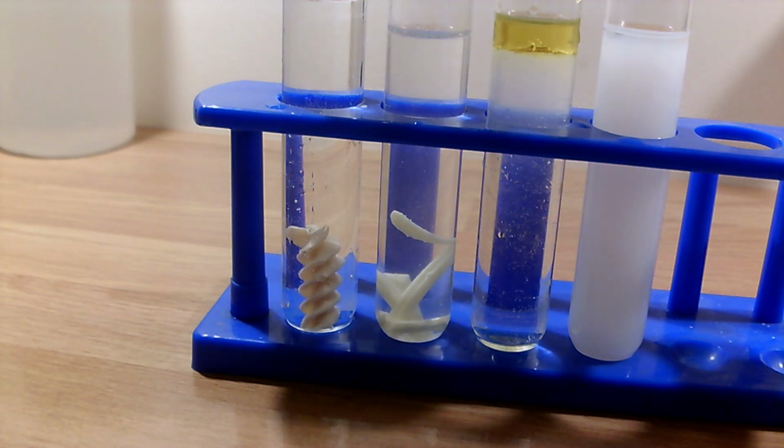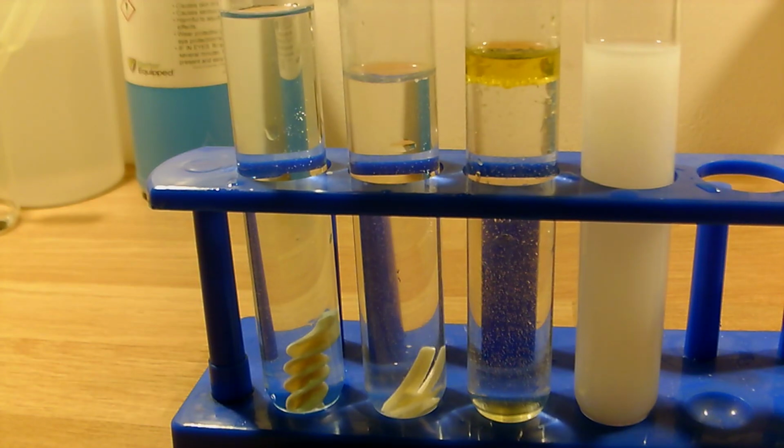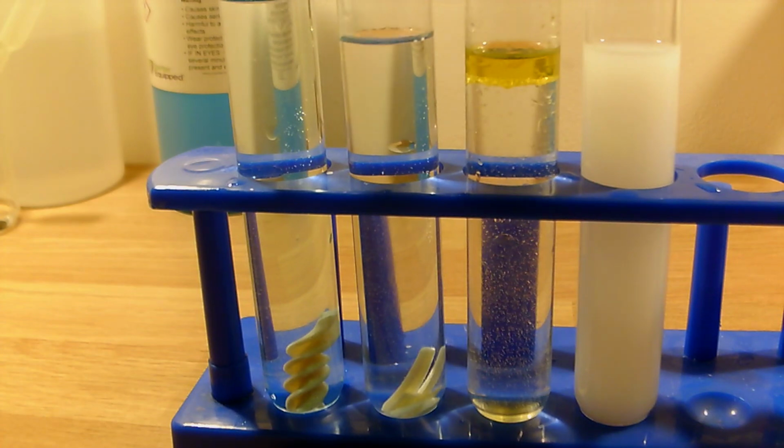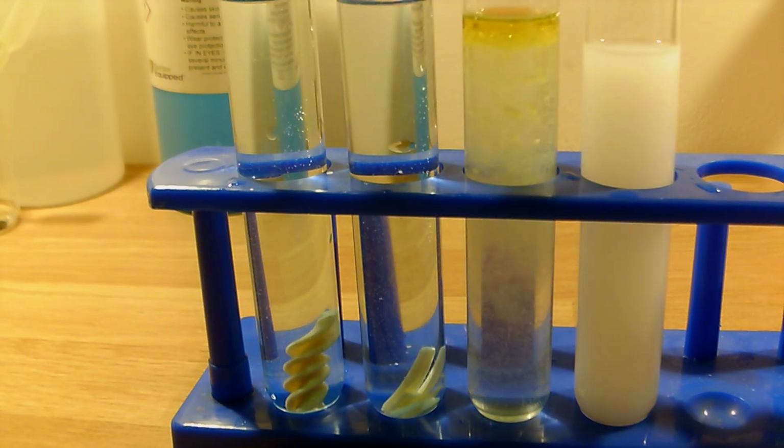We are now going to do the test for protein and we are going to use Biuret to do it. Biuret is a pale blue solution. We are adding the 4 different foods to the test tubes that we have washed again, and we are using a pipette to add the Biuret to the test tubes. We have to add it lots of times because not very much of it is coming out of the pipette. The pasta doesn't change colour when we are adding the Biuret to it because it doesn't contain protein.